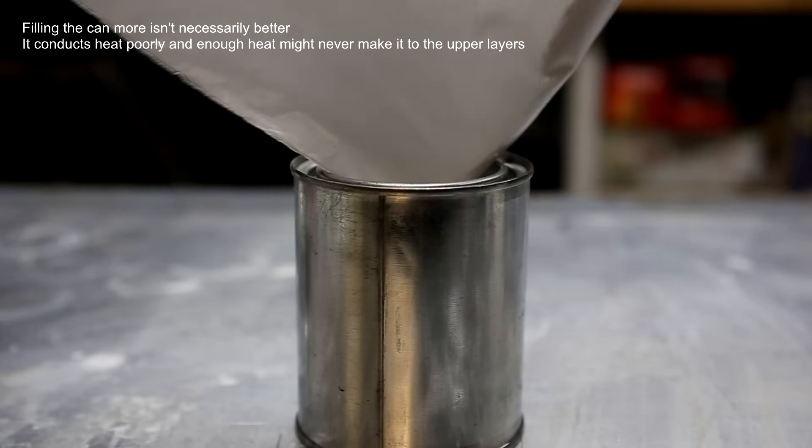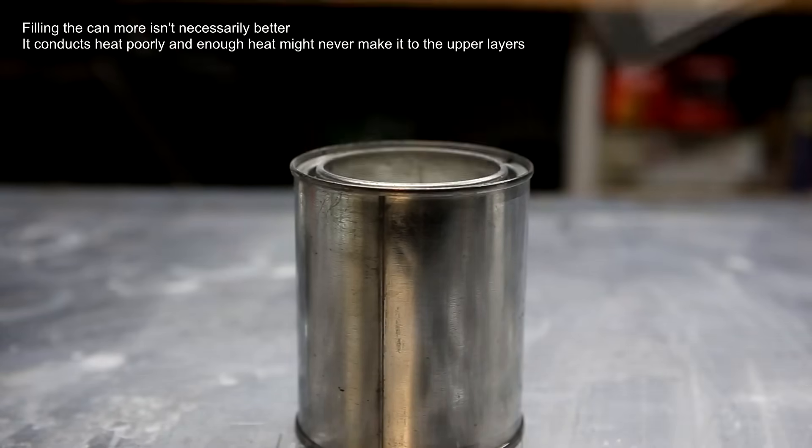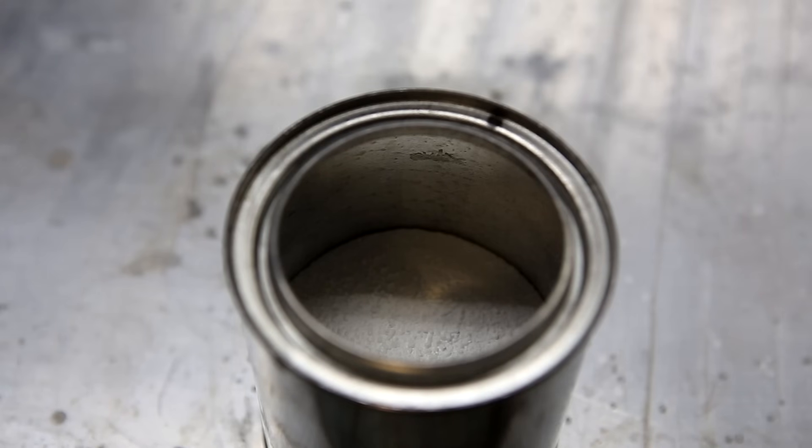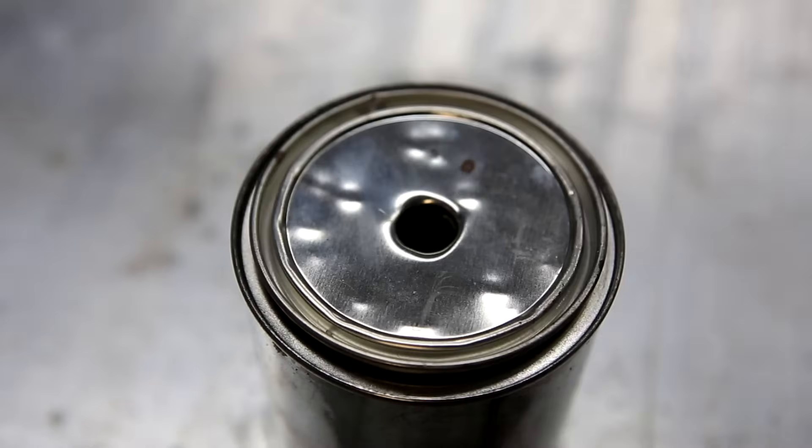The mixed powders were then added to an empty paint can. You can see here that the powder only fills about a fifth of the can. The paint can lid was placed on top with a pre-made hole.